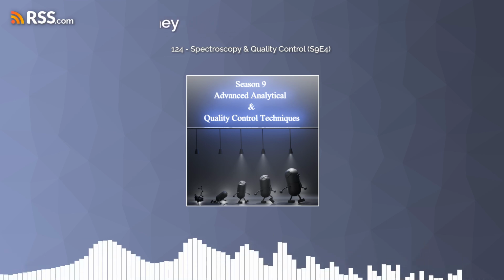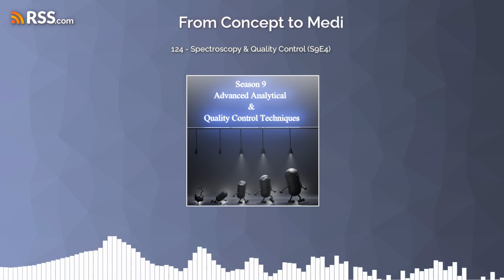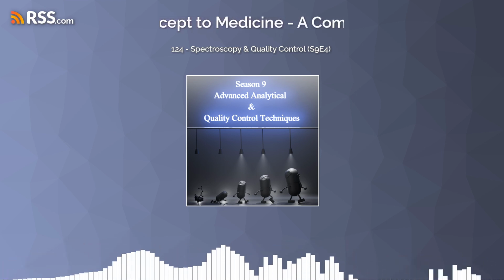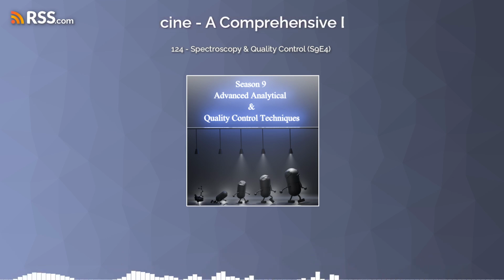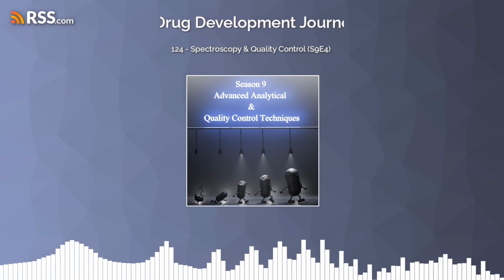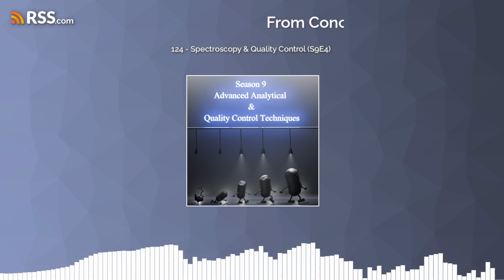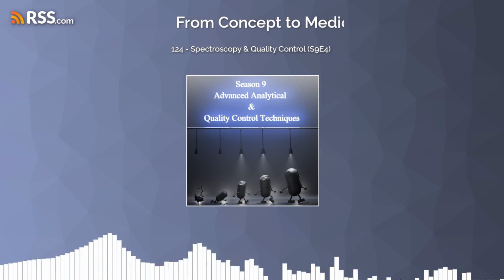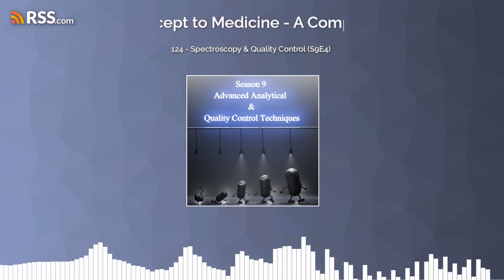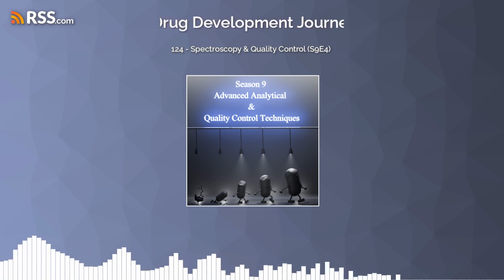What about Raman? So Raman, one of the big advantages there, we talked about it, is that it's non-destructive. You don't have to mess up your sample. You don't have to dissolve it in something or crush it up or anything like that. Exactly. You can analyze it as is, and you can analyze a variety of sample types, including aqueous solutions and even through packaging. So that's a big plus. However, the signals can be kind of weak sometimes. So you need a more specialized instrument to get a good signal, and those instruments can be a little more expensive. So that's something to consider with Raman.